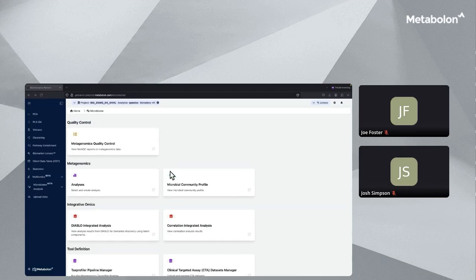Thanks, Joe. So, today we'll navigate through the Microbiome Tool interface within Metabolon's Integrated Bioinformatics Platform, or IBP. I'll be guiding you through each screen of the Microbiome app, and by the end, you should have a clearer understanding of the full suite of 12 metagenomics-focused tools available and how integrating metagenomics data with metabolomics data can reveal deeper biological insights.